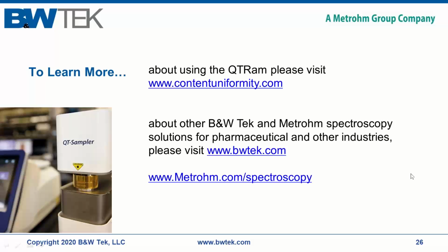Okay, perfect. Can this technique be used for biomolecule applications, so enzymes or proteins? Raman spectroscopy can be used in those areas. Keep in mind that Raman spectroscopy is not necessarily a trace level technique. Here we've shown low dose pharmaceutical ingredients at 0.5 weight percent. Depending on your matrix, you may or may not be able to detect lower levels. But yes, Raman spectroscopy is appropriate for many different types of samples.